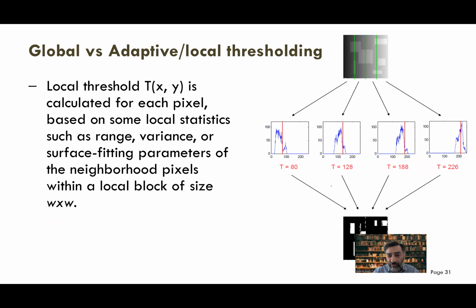Just somehow define your regions based on, you might consider, and that could be an experimental artifact, that you have this problem in a microscope, or because of the certain experiment, that there is always a bright background here and a dark background here. Then you can define an area where you could have a threshold maybe a little bit higher, and an area where your threshold could be a little bit less.